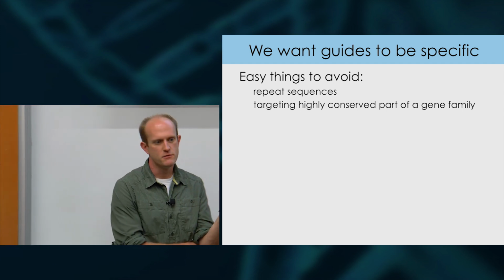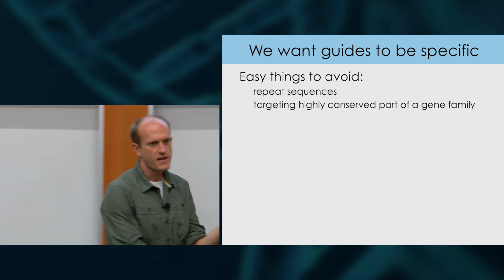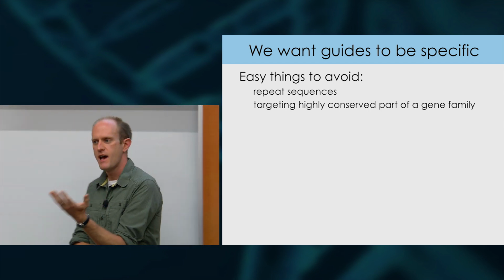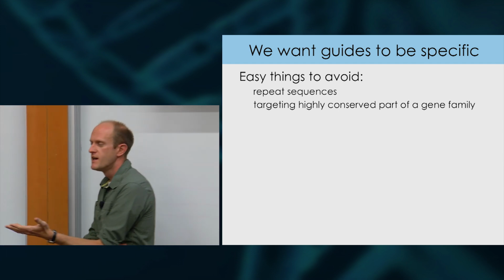Let's say you want to do editing for hematopoietic disease, and you need to edit 10 to the 6 cells. So you're going to edit those cells, and you're going to try to find some off-target. So let's say 1 cell or 5 cells have that off-target, and you're going to put those back in. Let's say it's a really bad off-target.